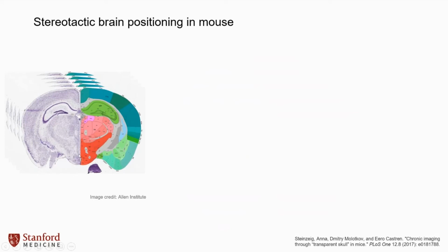So really briefly, what is stereotactic brain positioning in mouse? I bet everybody already knows, so I'll be really brief. The one advantage of the mouse is that the brain is extremely well characterized, and it's hardly ever different. So it's not like a human where some people have really big skulls and really different brains and some very small. All of these mice look pretty much the same. So if you know where you are on the skull, you can basically point your beam and have pretty good confidence that you're hitting some region that you're trying to target.